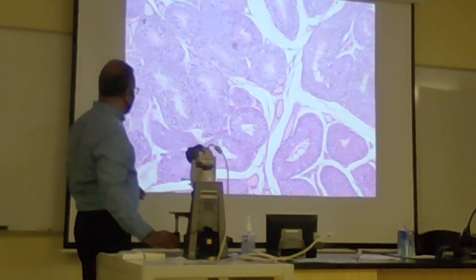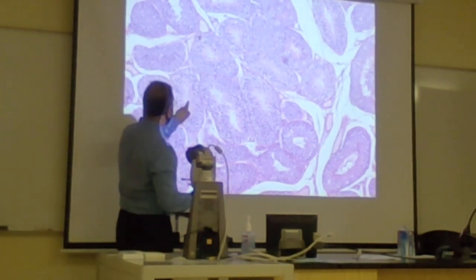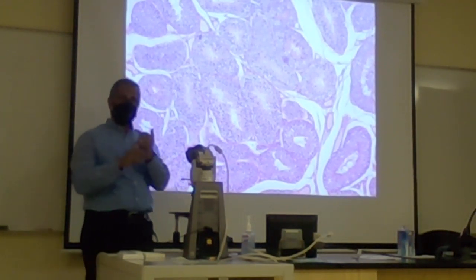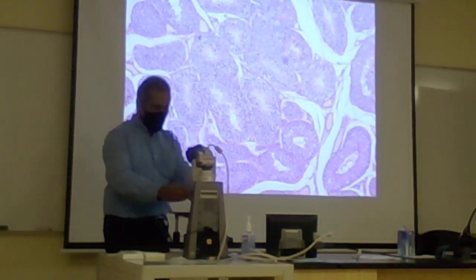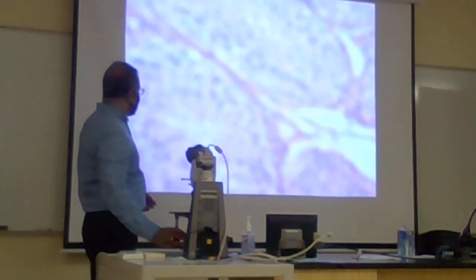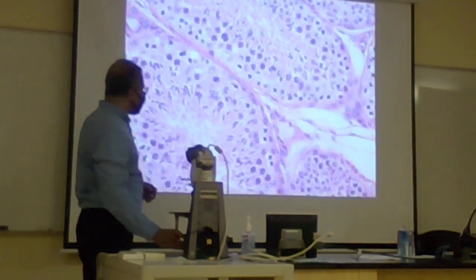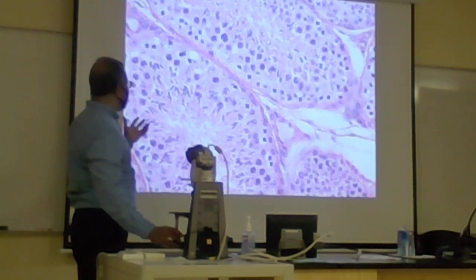So one of them, you can see there are some sperm right in the middle, the center. These are all of those spermatogenic cells, the nuclei of those primary spermatocytes, secondary spermatocytes, and spermatids, and so on. In close view, you might see that some of them are undergoing subdivision. You see the chromosomes here? The chromosomes separating. Yes. So they are undergoing cell division.